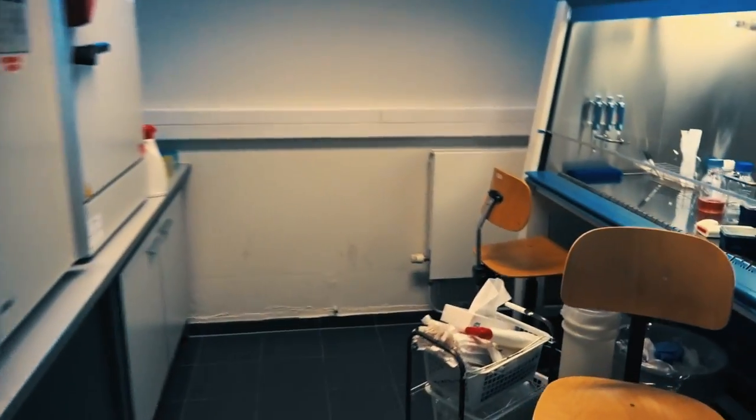This is how our cell culture lab looks. So we have a fume hood to work with the cells, an incubator to grow the cells in, and fridges to store everything in. This is how our cell culture lab looks.